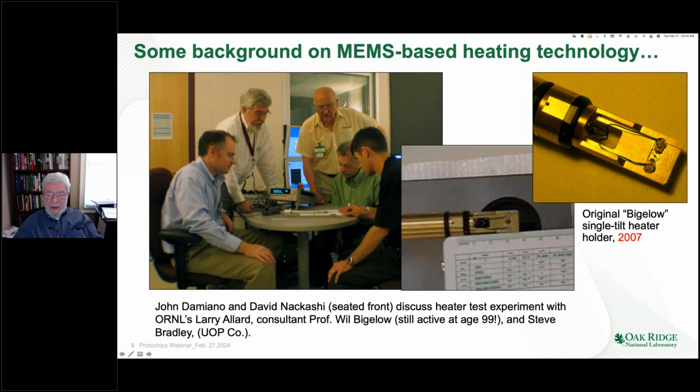Okay, so this was a bench test, and here's a movie. This was the first time we actually used and heated this holder. This is out in the atmosphere on the bench, running with this controller, and this is heating to 1,000 degrees. You can just get a feeling for how this works. This was quite exciting to see that we actually made a holder, and they're very robust because they could be heated up in an atmosphere to 1,000 degrees and could do this thousands of times.